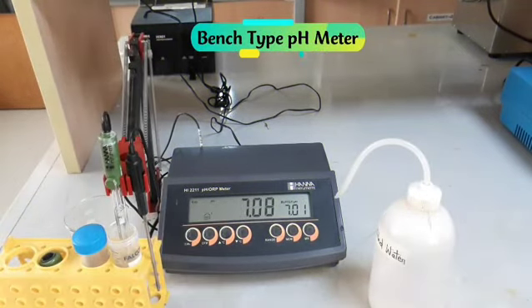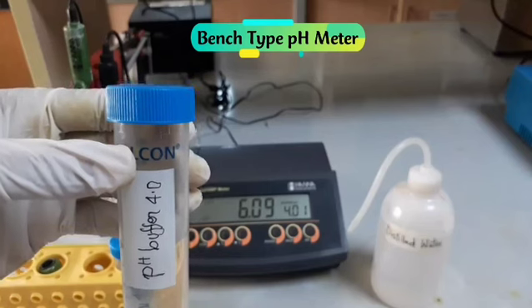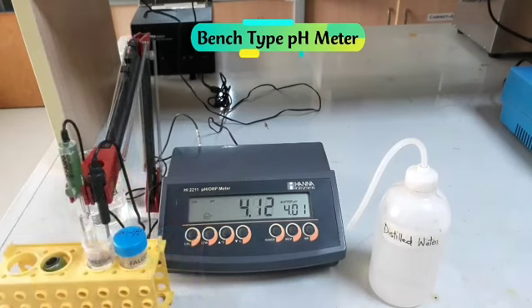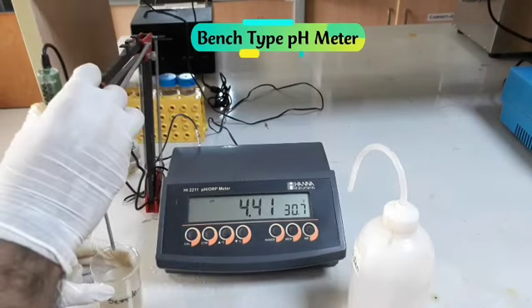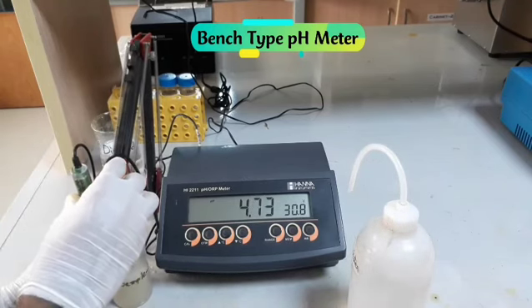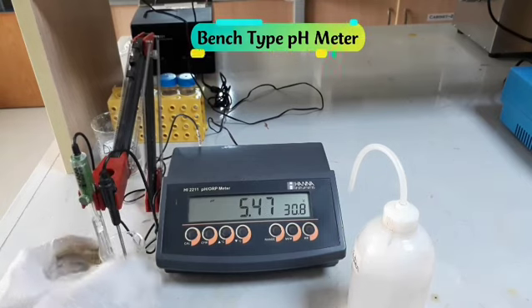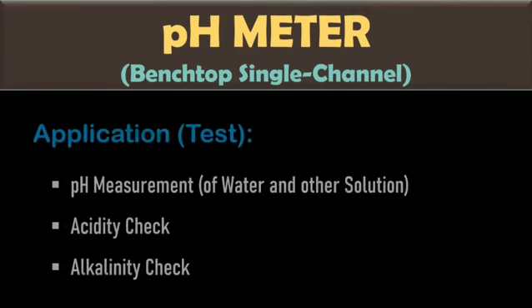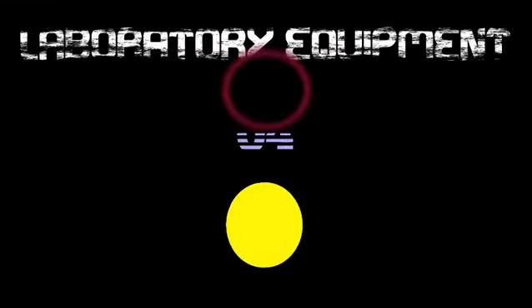The pH measures the hydrogen ion concentration of a solution, indicating how acidic or basic it is. Highly acidic foods like pickles and vinegar need regulation of pH. This pH meter is very useful to detect the pH. The pH of water and other solutions can be measured. Acidity checks and alkalinity checks are other applications of the pH meter.